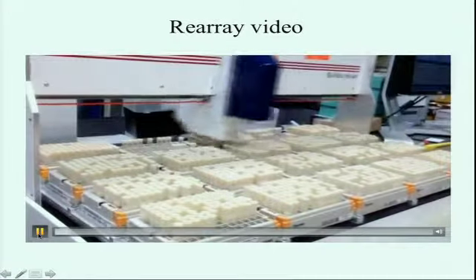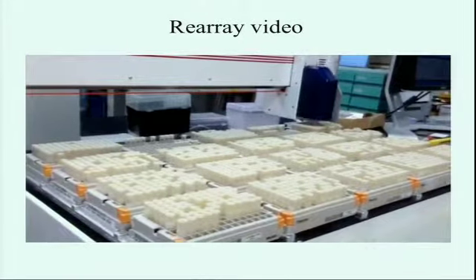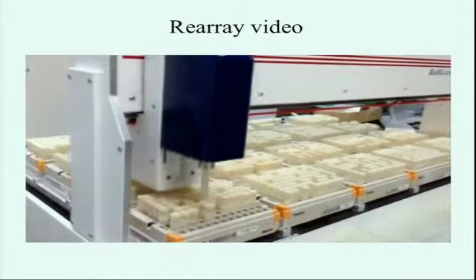Once everything has been loaded, all your destination racks and all your source racks, the robot will read the RoboFile and just cherry pick out the appropriate reagent and put them in the destination rack according to the plate map that's been designed.